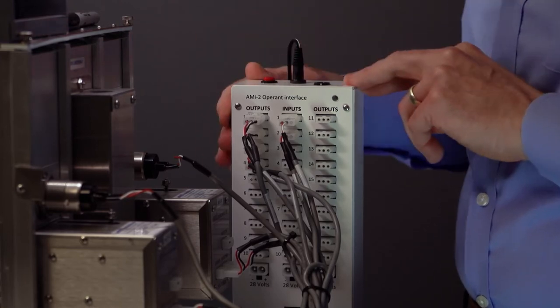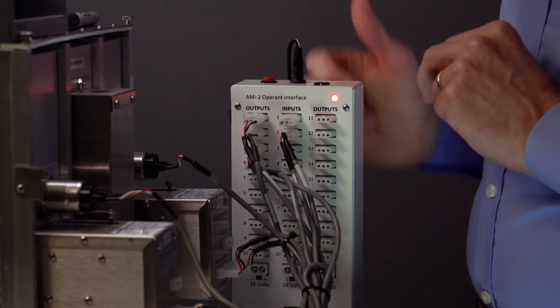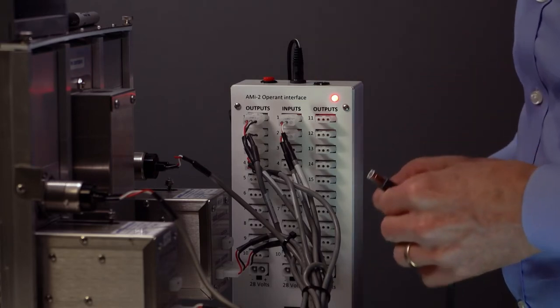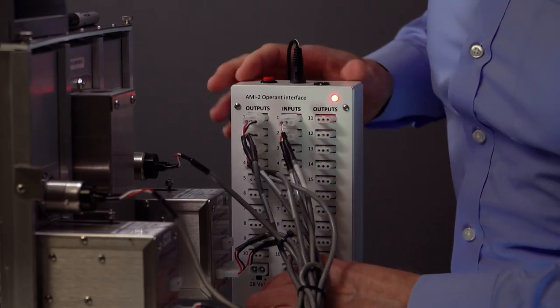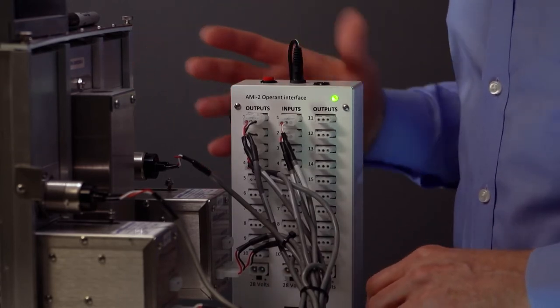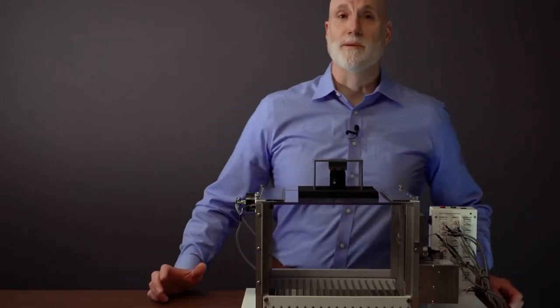We'll do so by connecting the power. We find that there is a red light. That means that the power is connected. And now we just need to connect it to our computer. In doing so, we'll turn our light green, and we're ready for use. That's it. And that's how we physically set up a single cage.